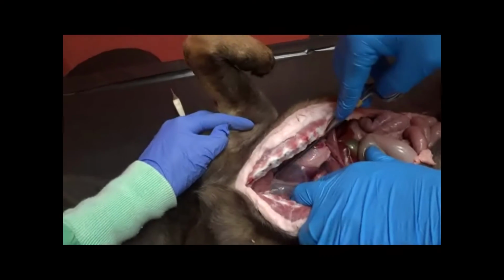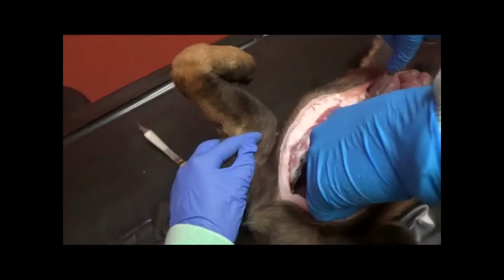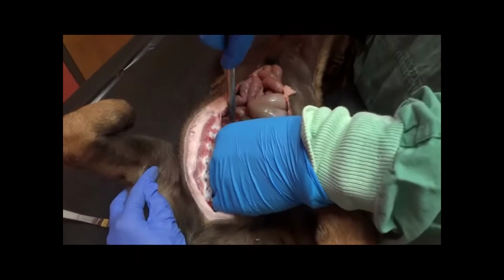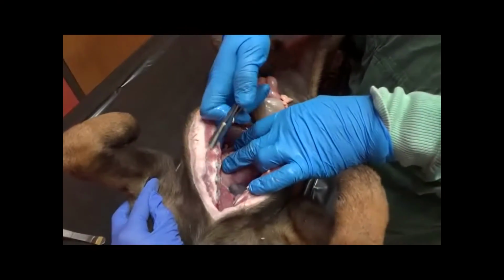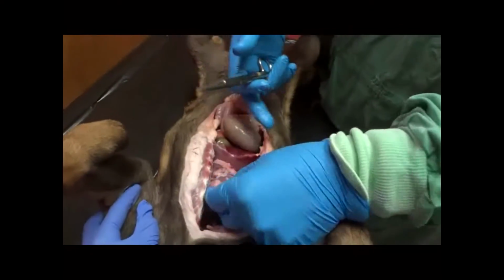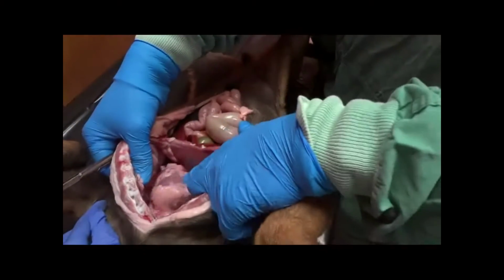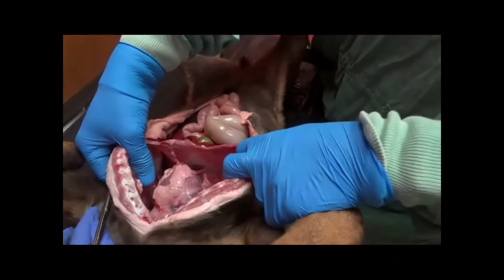There is vena cava. So if you're looking at a pathology, you could certainly take the heart out and weigh it and make sure that it meets parameters. You could look at chambers as well to see if chambers are enlarged or if there's any kind of congenital abnormality like a patent ductus arteriosus. So that would be the extent of it. If you wanted to, you could get a piece of the lung just as we've done the others with a sampling technique with just a scissor, but everything there is kind of as expected. So that's the extent of our necropsy.